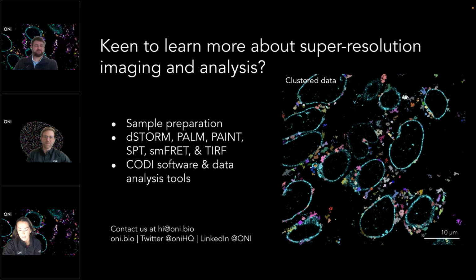Great, thanks so much for that, Corey. Okay, next question we have. What does it mean for the image and data if the drift calculates no drift?